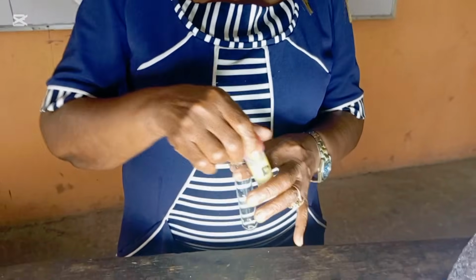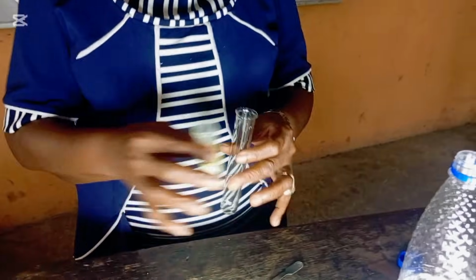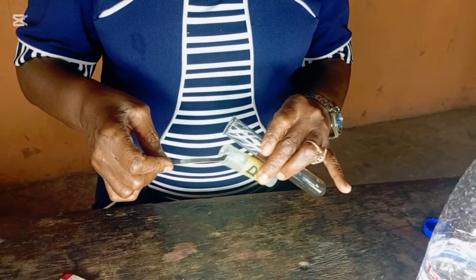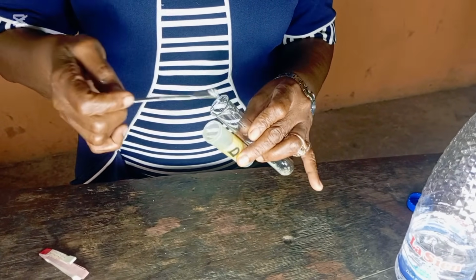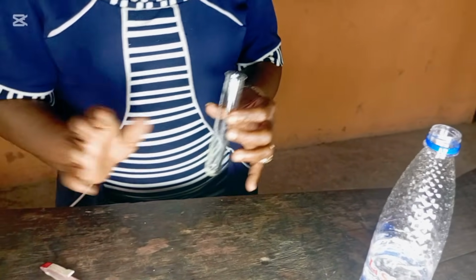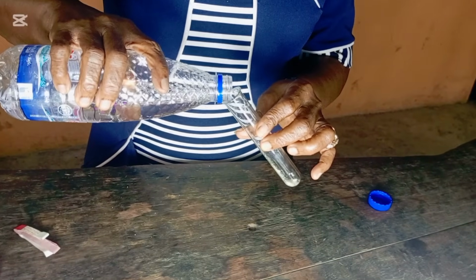That's the second sample. I'm going to now use all of them. So sample D plus water, about 10 cm cube.